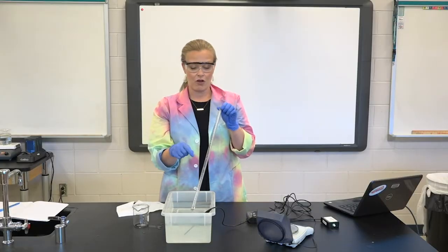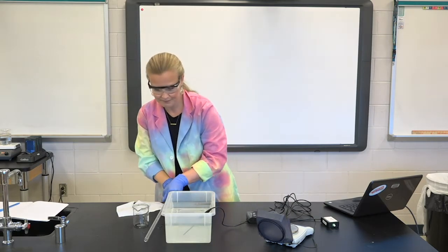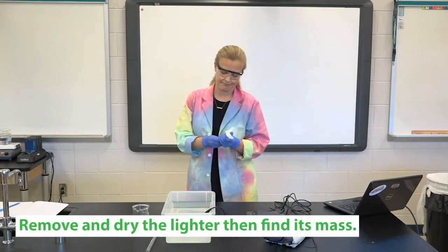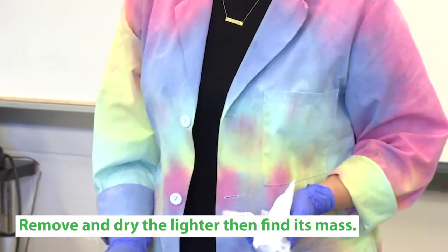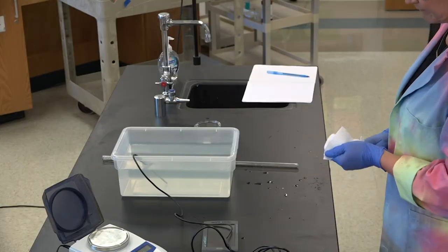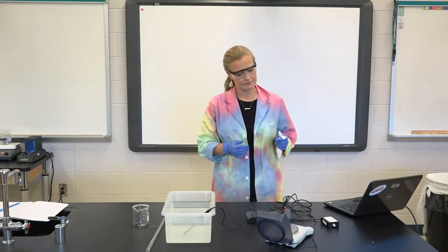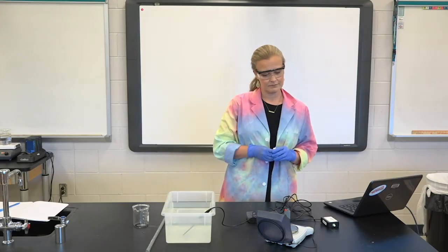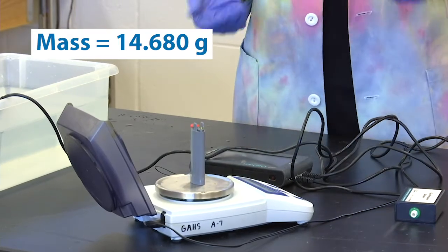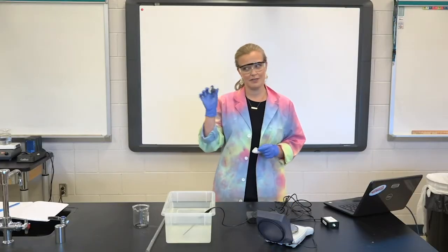Now that we've got that volume reading, we don't need the eudiometer tube anymore. We can pick it up, let that last bit of liquid run out, and set it off to the side. Now we need to get our lighter out of the water and dry it off — not just on the outside, make sure you've tapped it off and anything on the inside is dry as well. 14.680 grams is our mass at the end, which is slightly less than at the beginning — that makes sense. If your mass ever goes up, you probably didn't dry it off adequately.